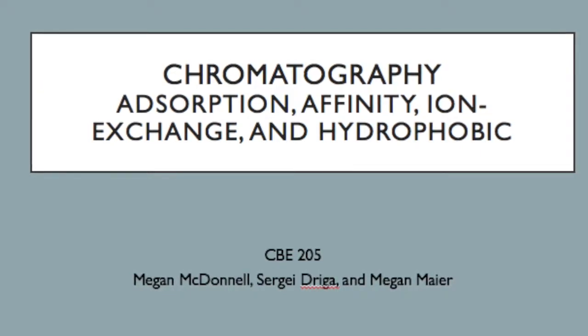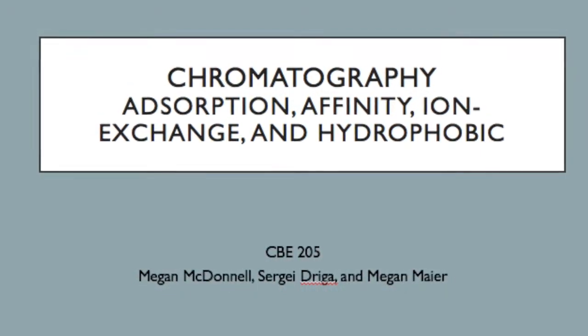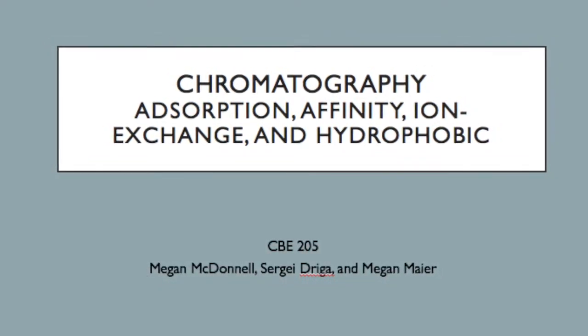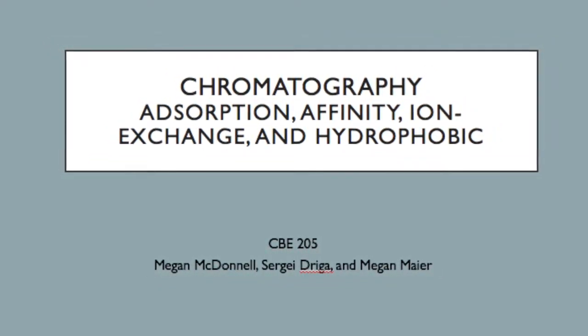Today we're going to talk about chromatography and four of these kinds that we discussed in class, which are adsorption, affinity, ion exchange, and hydrophobic.